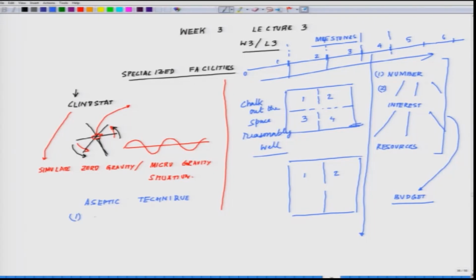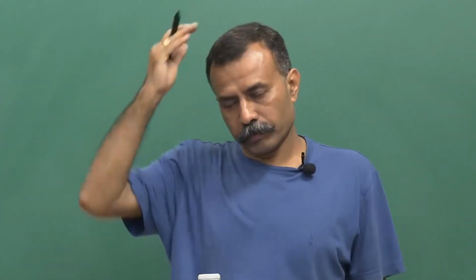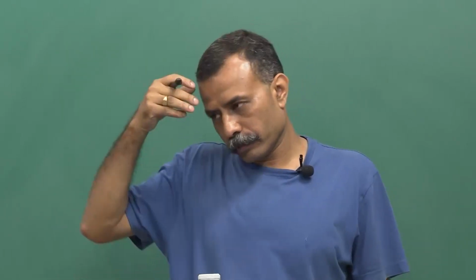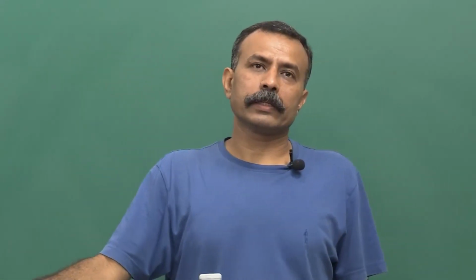Second, personal health. Next, make it a mandatory point to have the hair caps, so that if there is hair fall or something, it is not going to contaminate the system.